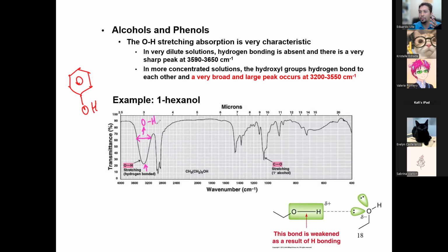Remember in the animation I showed you earlier, you had that hydrogen beating up against that oxygen. That is this signal right here. That is the OH signal. It's very broad. It's strong. I wouldn't say very strong, but definitely strong, right? It's at 25%. That's definitely strong. But it's broad. It goes between 3200 all the way to about 3500.